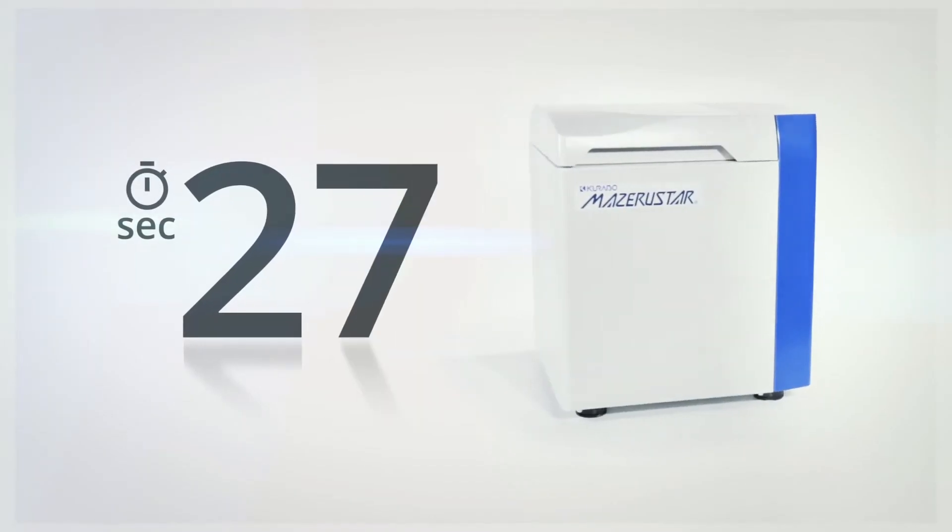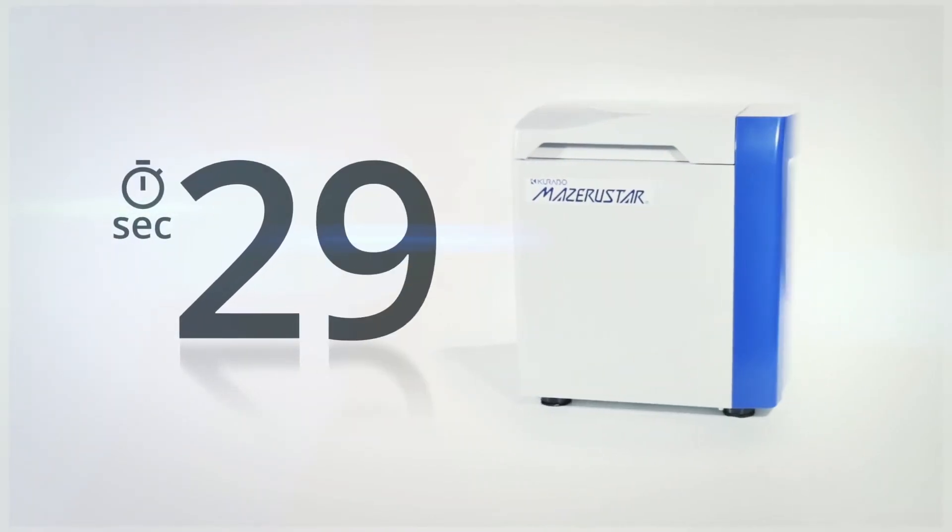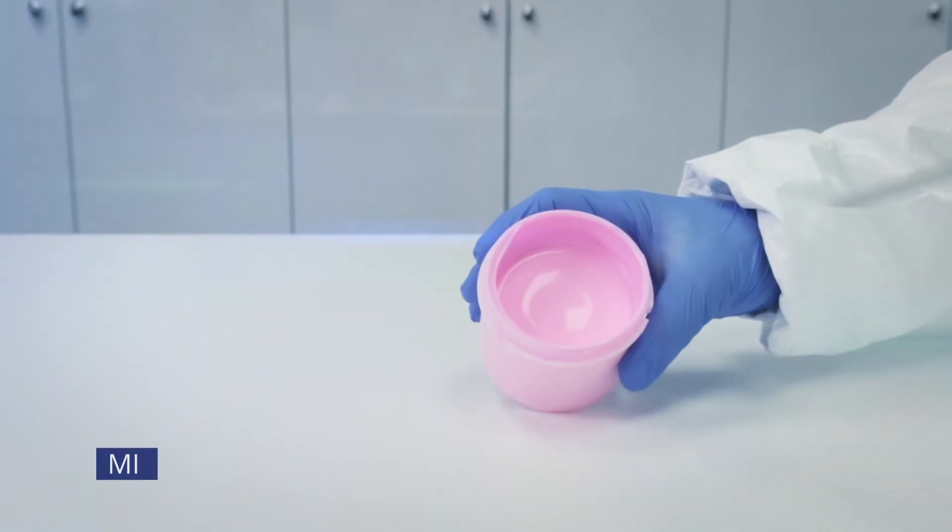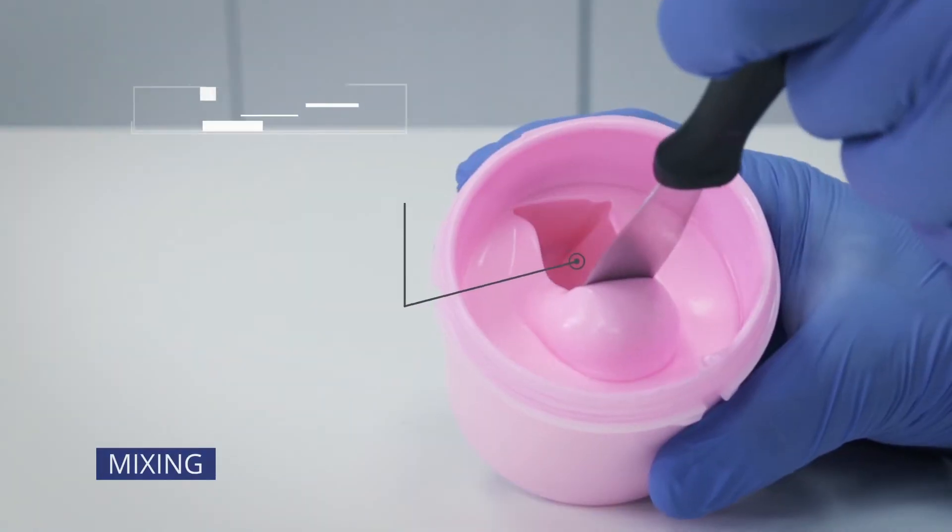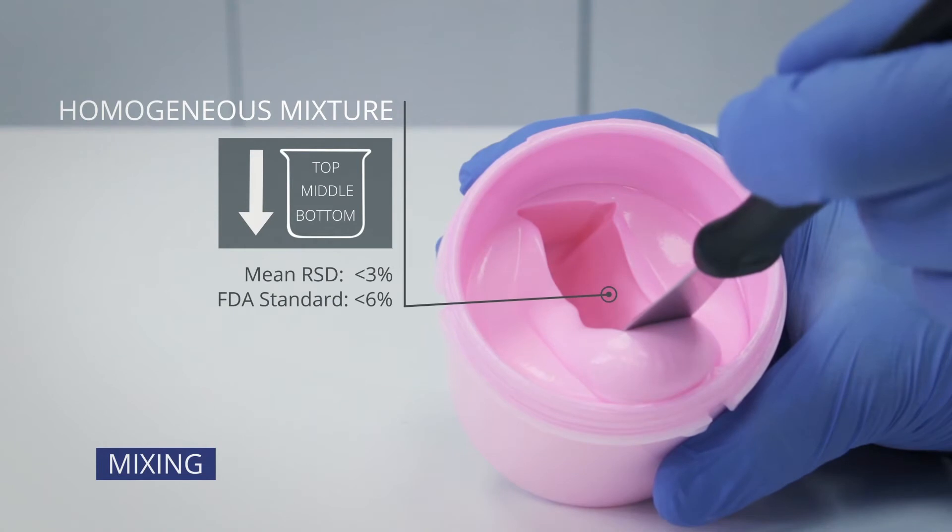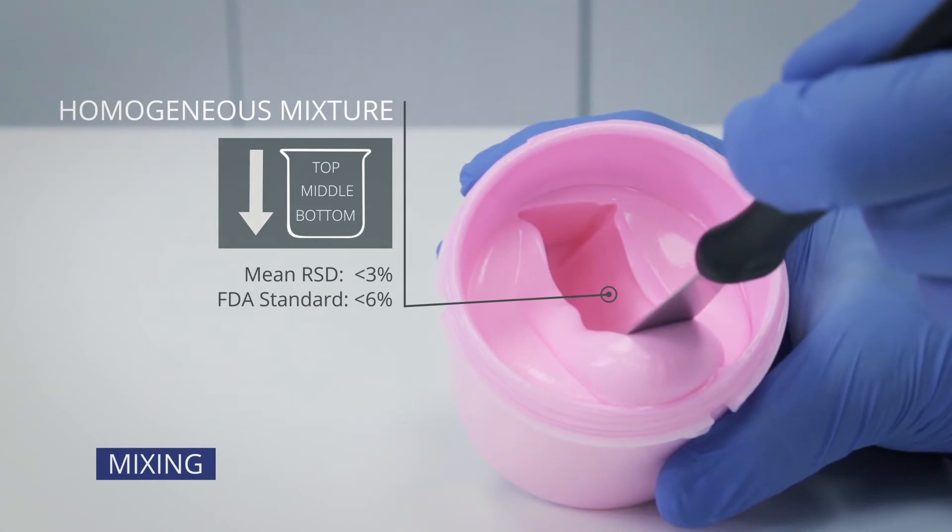The MESS can mix and de-aerate a topical compound in just 30 seconds. By streamlining their compounding process, the pharmacist can ensure to deliver quality preparations to their patients while saving time and money.